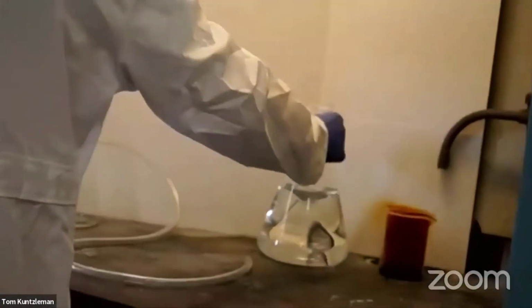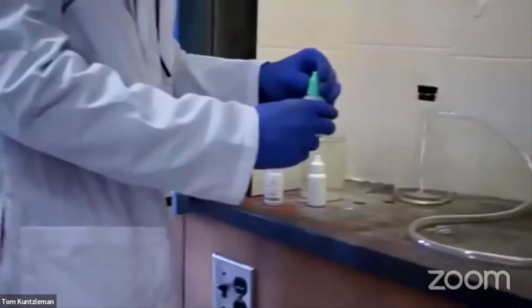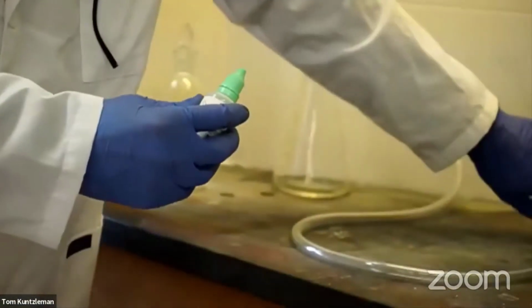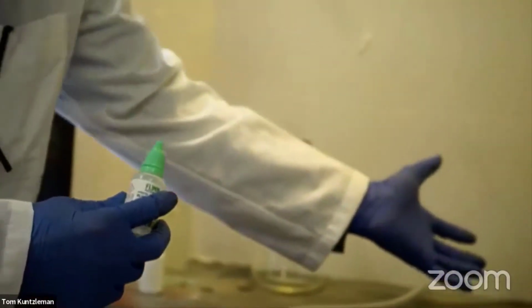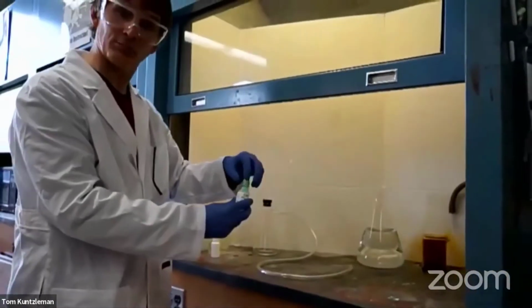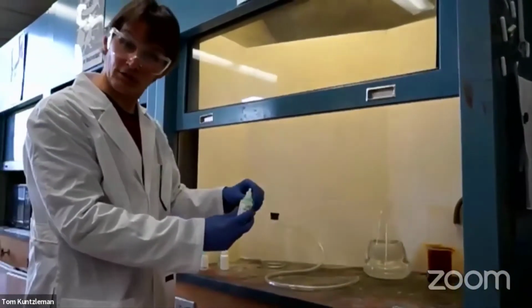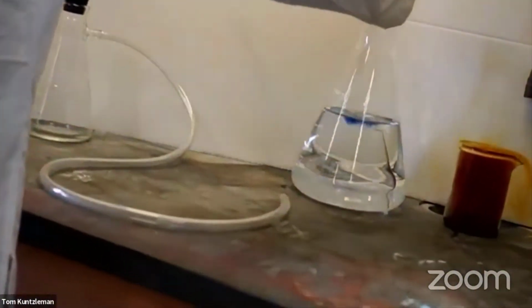So I've added my base, and now I'm going to add an acid-base indicator. What this does is it tells me if this water is acidic or basic. Well, I just added a base to it, so we know it's going to be basic. And this particular indicator is going to be colored blue if it's in a base, and it's going to be colorless if it's in an acid. I'm going to add some of the acid-base indicator.